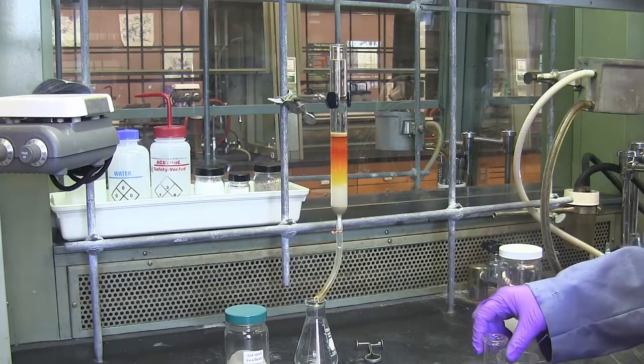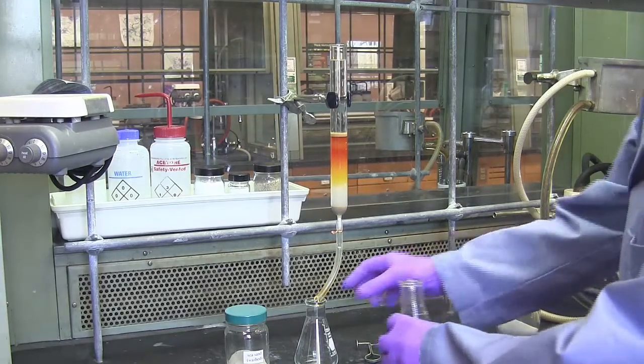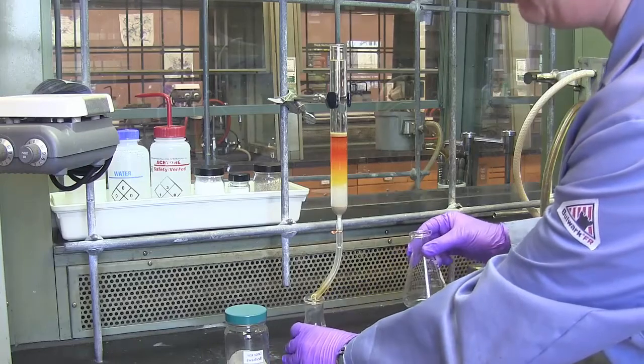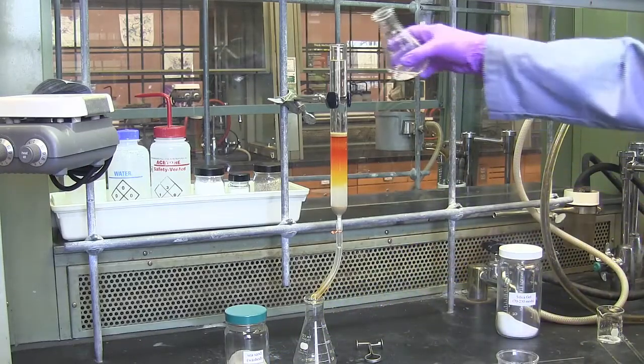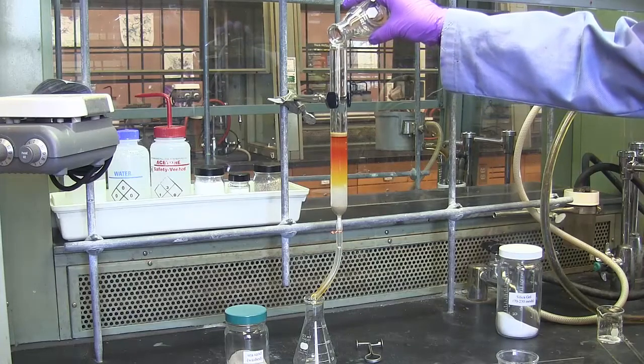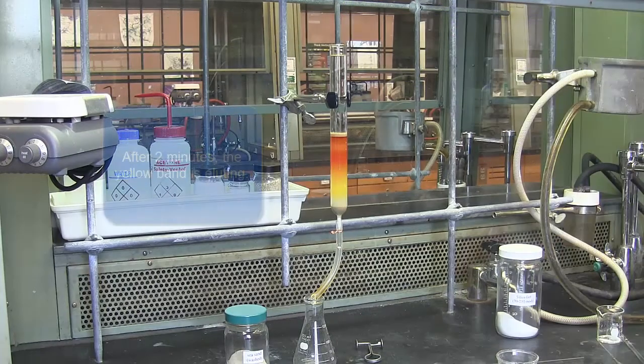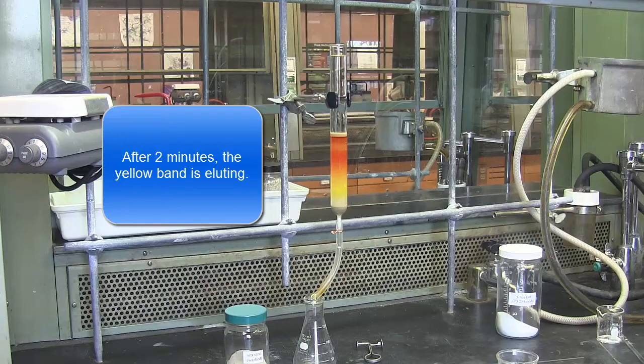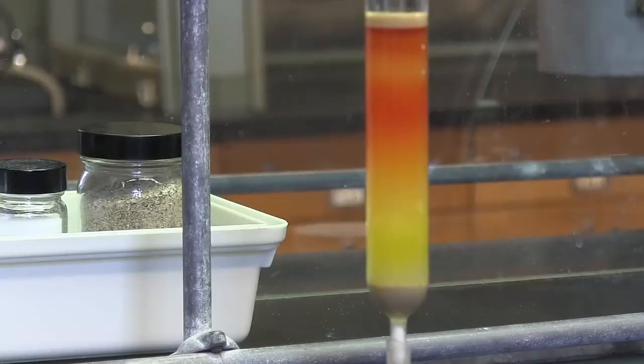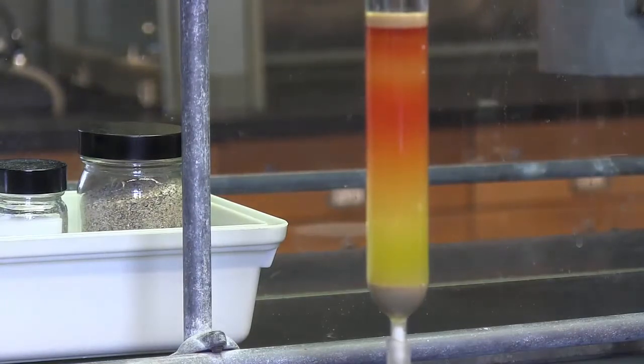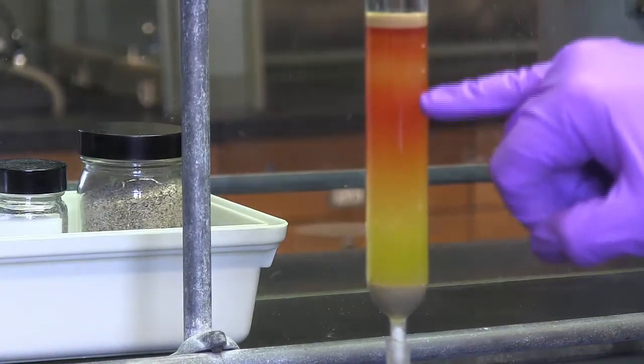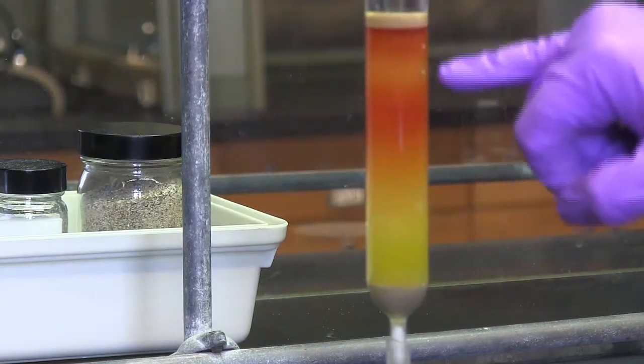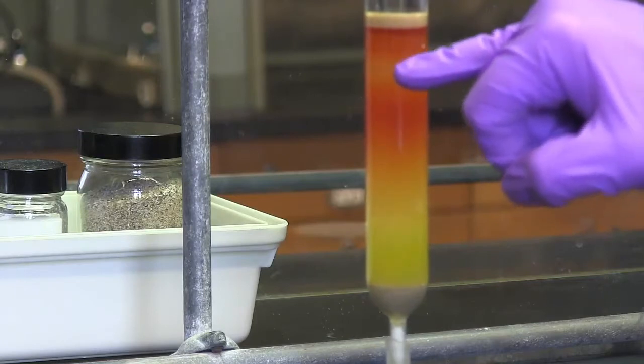Once the first band approaches the bottom of the column, the sand, you can switch to a collection flask for the first band. Again, this solvent is clean right now. I can recycle it if I want. The first band has reached the sand and is eluting into the collection flask. I can also see some separation between a component here and whatever is more polar and still stuck to the column. I'm seeing a little bit of white silica developing here in the middle. So here's a yellow band that's coming off.